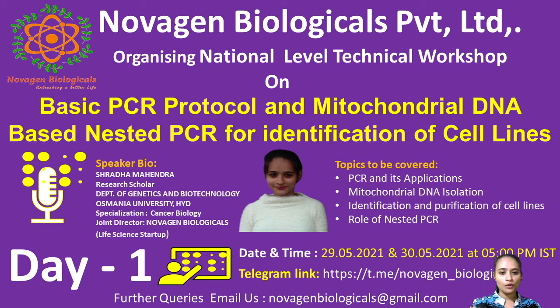So today the topics I'm going to cover are the background behind PCR, what is PCR, different modifications in PCR, as well as the cycling conditions in PCR, what components and reagents we have to take in PCR, and how to document your PCR product and its various applications.